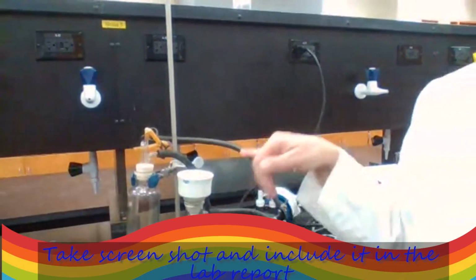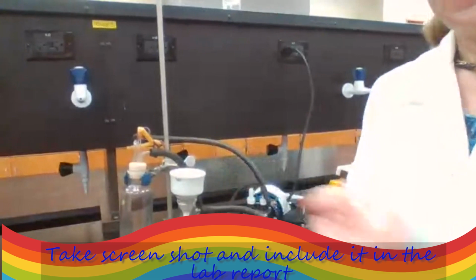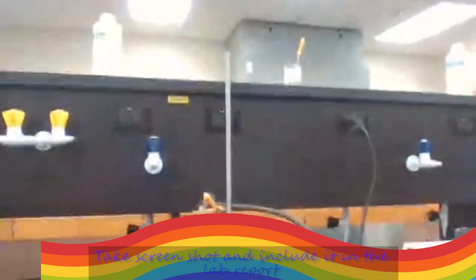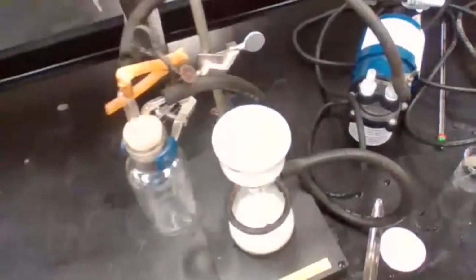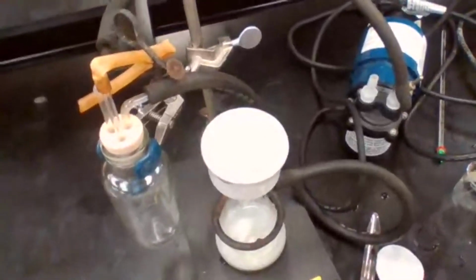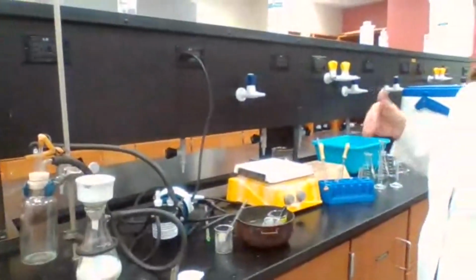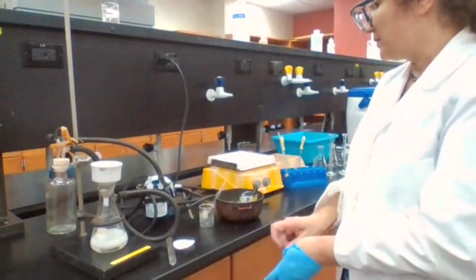Okay. Since in our first setup, the first test tube, we got proper product, I'm not using the second setup. You see these white crystals up there? There's no yellow or brown crystals. So our product looks fine. I don't have to continue with the second set that I left inside the test tube earlier.